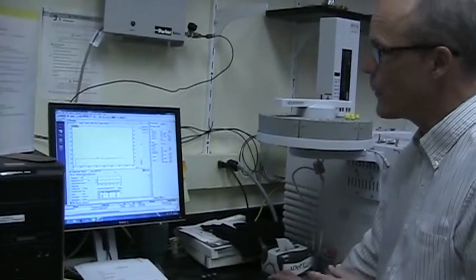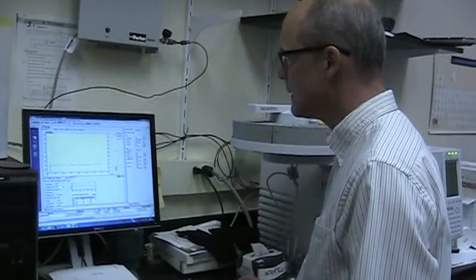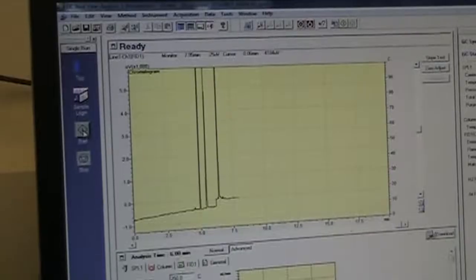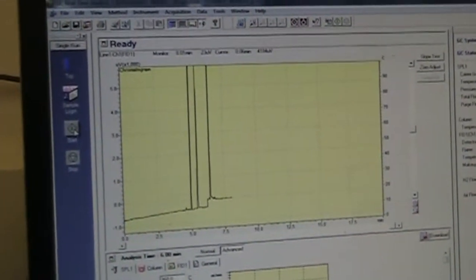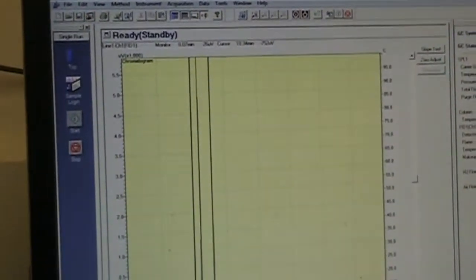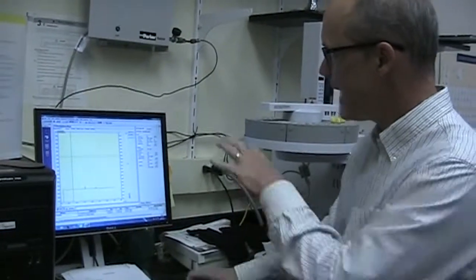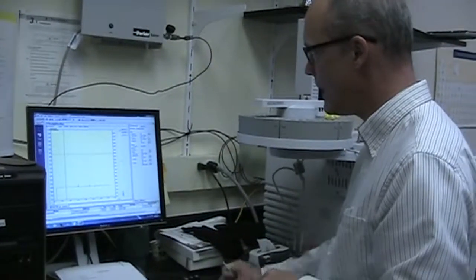And then we're going to click start on the computer, which is this icon here, and you'll notice that the instrument goes from ready. When I click on start, after a second it says ready standby. It's basically waiting for me to make the injection. So that's all you need to do on the computer to get it ready for the data.